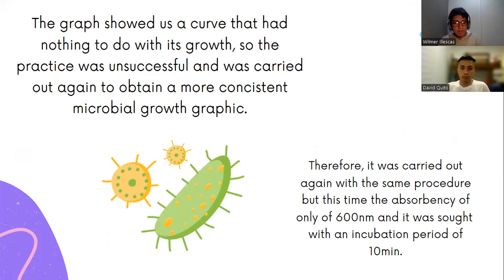We speculate that the problem is in how we measured the absorbance, because to measure the absorbance we have a sort of cube, and this cube has a sort of arrow, so the arrow has to be in front of the light. Maybe that was a problem, that we didn't put the tube accurately in the absorbance equipment. That would be one reason.